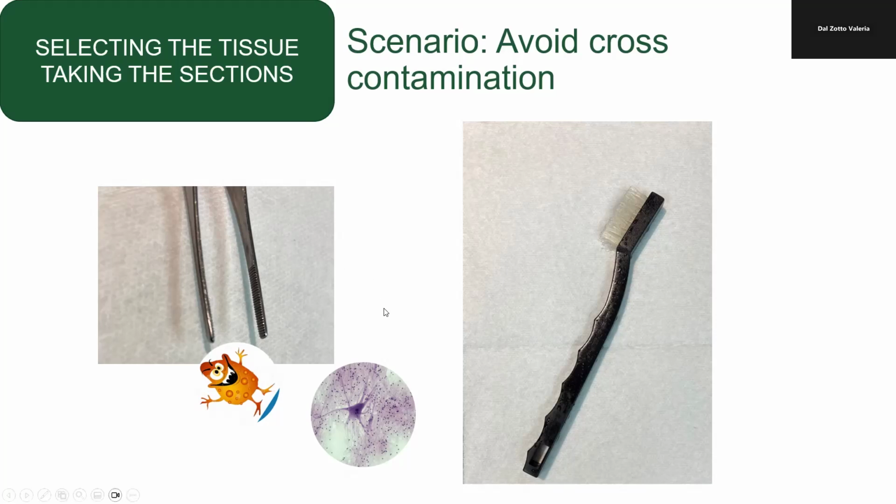And we are going to be very attentive, observing how you do your procedure. And if I don't see that you do it, I will tell you, please clean your tools.